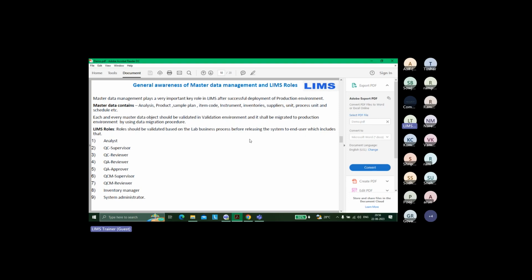And you know how this is done in most LIMS, like this particular role, admin. You will see that admin has all the functions assigned to him. Like, there is one particular function, approve sample. So he can approve samples, reject samples, reject tests. A particular LIMS may have 300, 400, 500, I'm not sure, functions. Now, when he's a super user or super admin, he has access to all those functions. He can do all those functions.